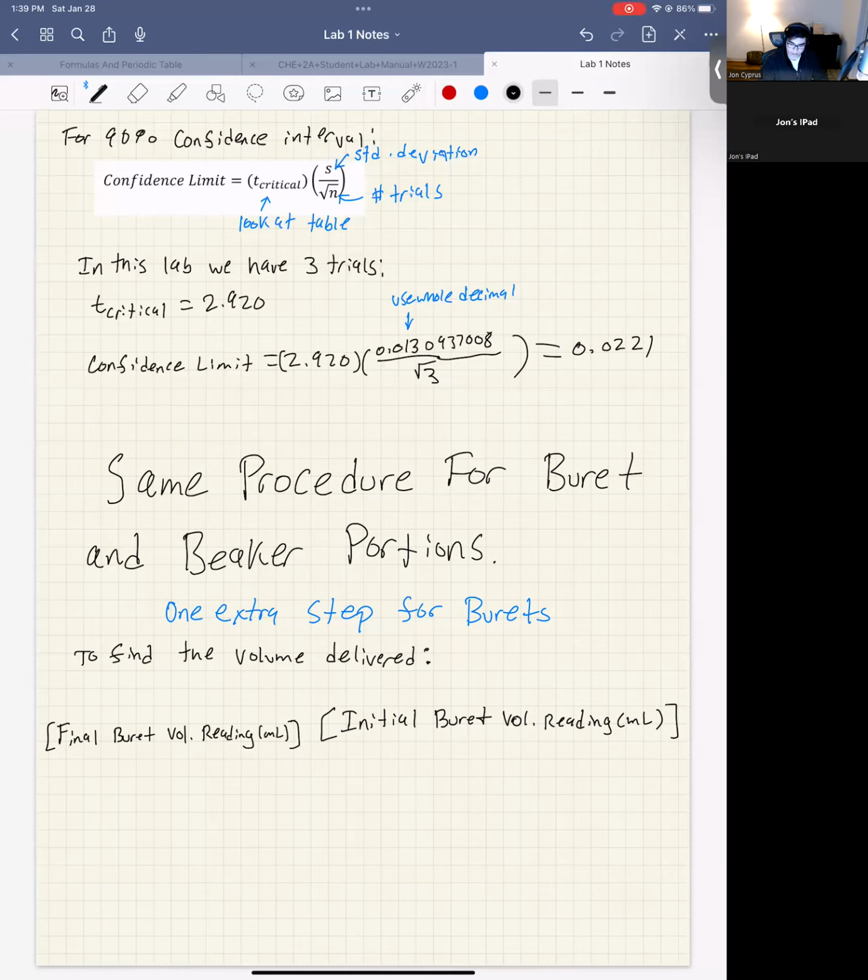So you should have, for this lab, measured the initial and final volume of your burette. I know I mentioned you don't have to get it exactly to 12. You shouldn't be doing that, but you should just pour it to some height that you can read. So like 3 is a good one. You stop at that 3 mark, and then as you drain out the water, you would want to go to about 15 to deliver 12 milliliters for this lab.